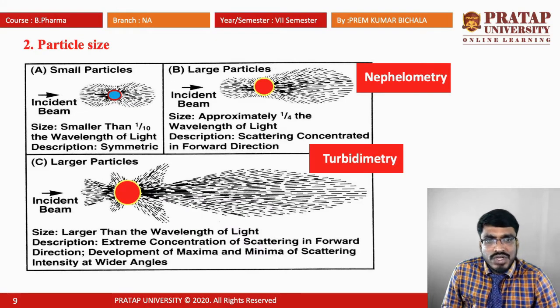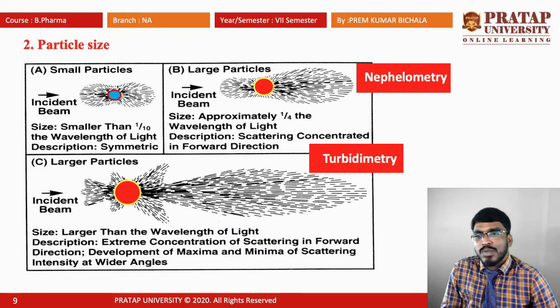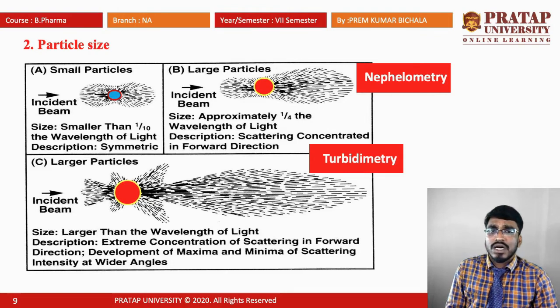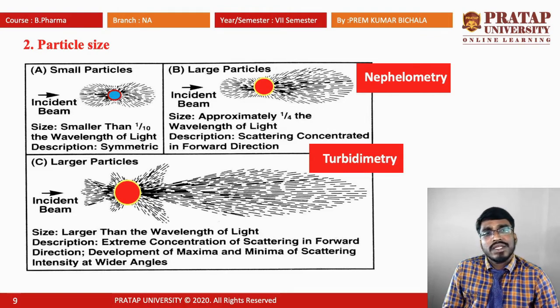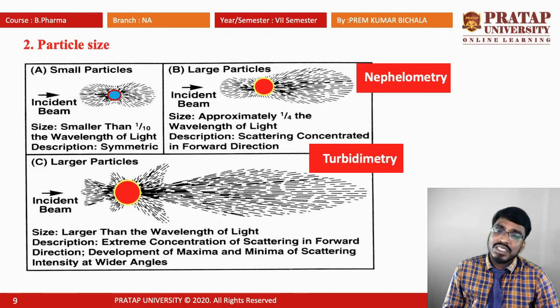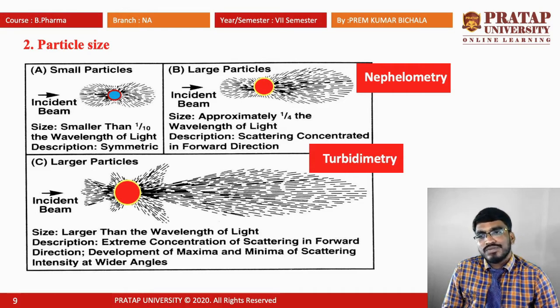Small particles and large particles should be measured under nephelometric conditions, whereas still larger particles should be determined by turbidimetry.